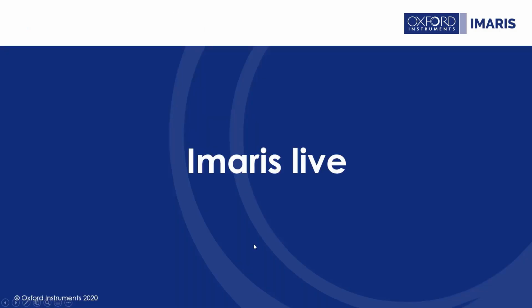So that's it for now in the PowerPoint. Let's move on in Imaris to show you some examples for creating Vantage plots.